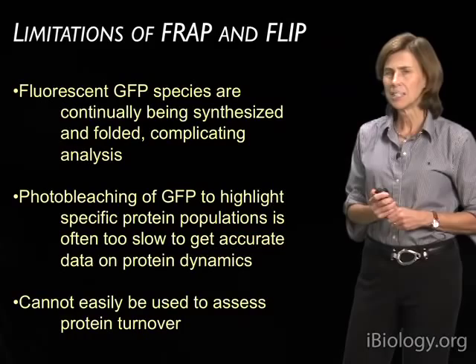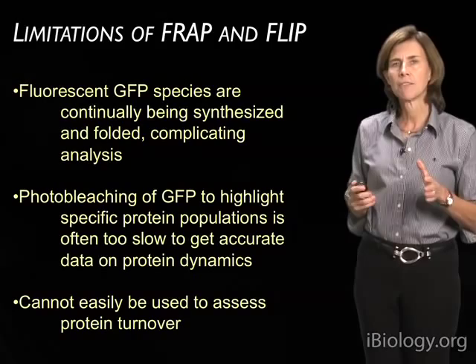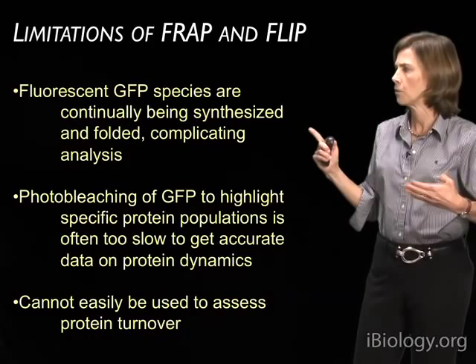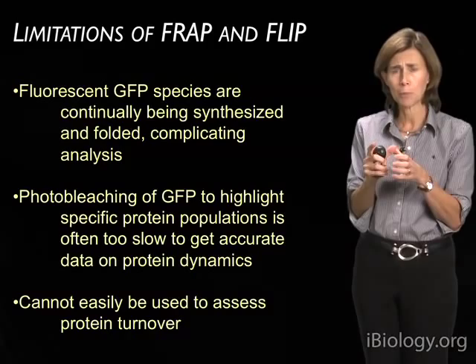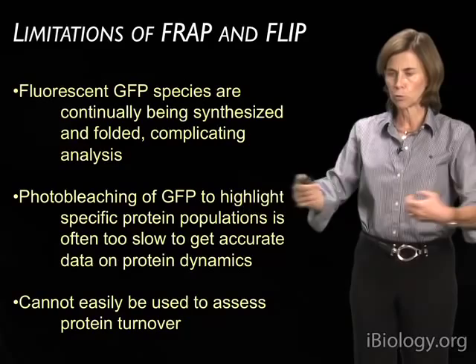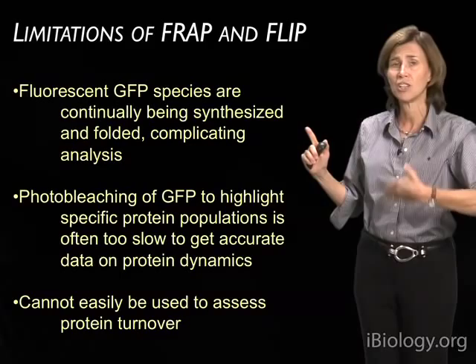Now, even though FRAP and FLIP can provide all of these really interesting insights into protein dynamics within cells, they do have some limitations. These include the fact that the fluorescent GFP species are being continuously synthesized and folded during the course of any photobleaching experiment. So if you're doing a long recovery kinetics, one has to be aware of this, that some of the kinetics may actually be more than just lateral exchange of these proteins with each other, but could be due to actual new protein synthesis that brings in new fluorescent species that have never been photobleached.